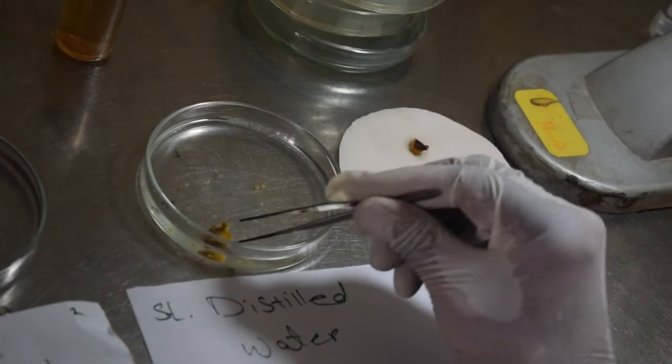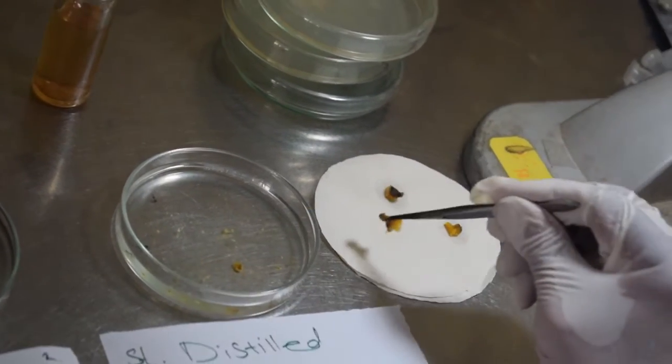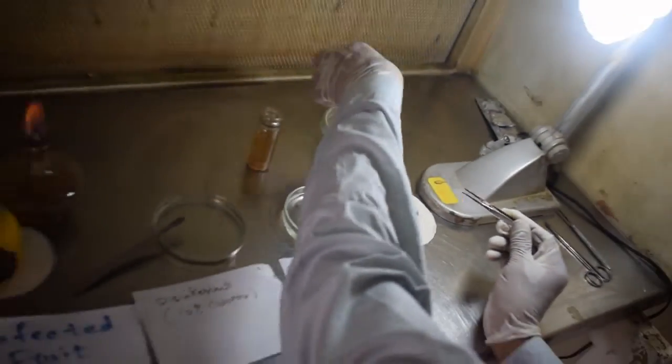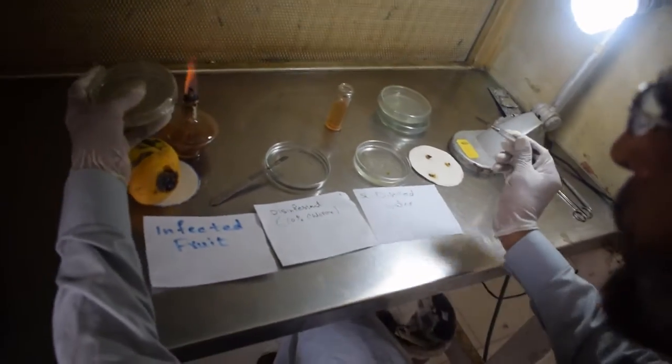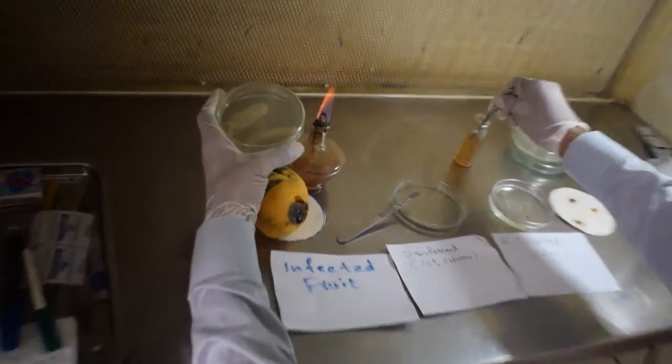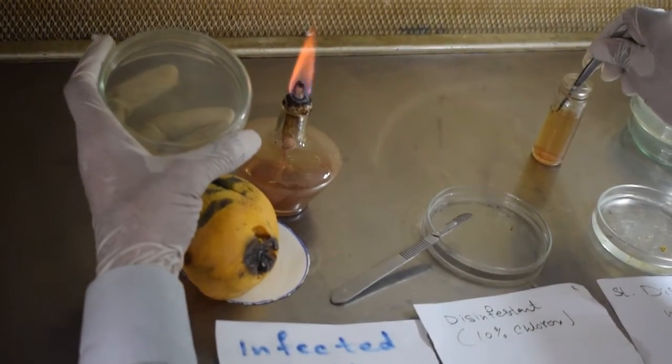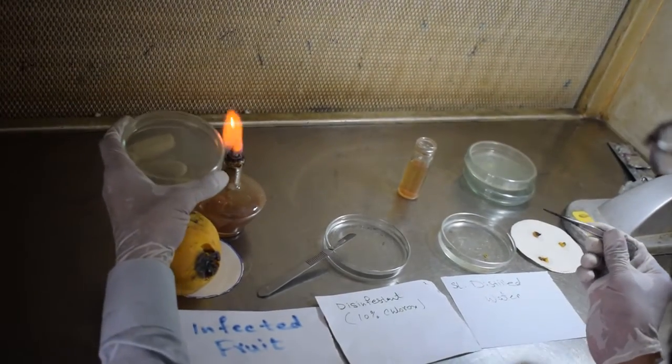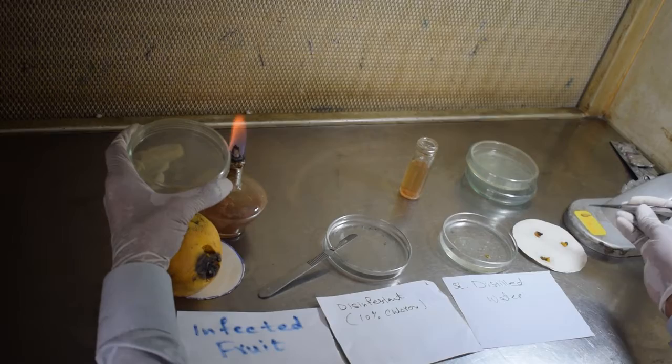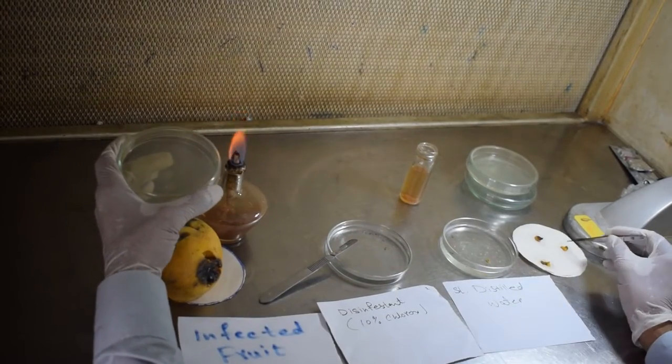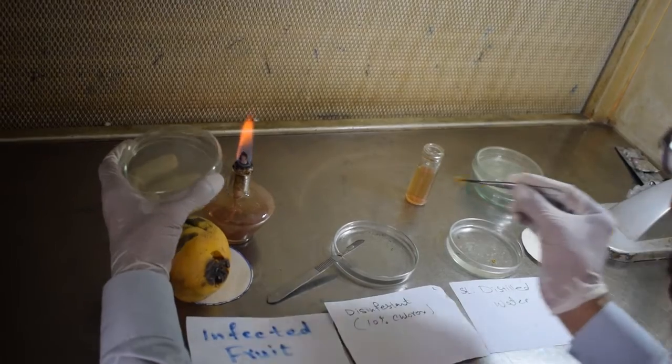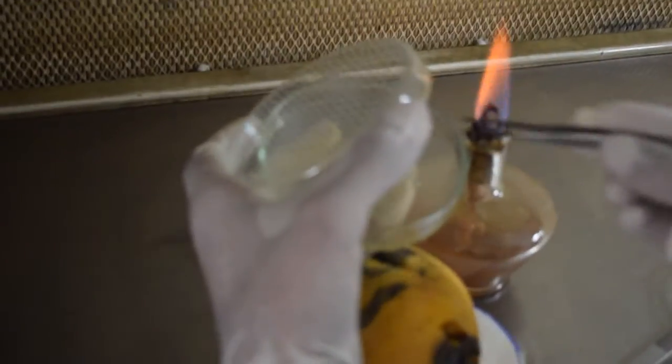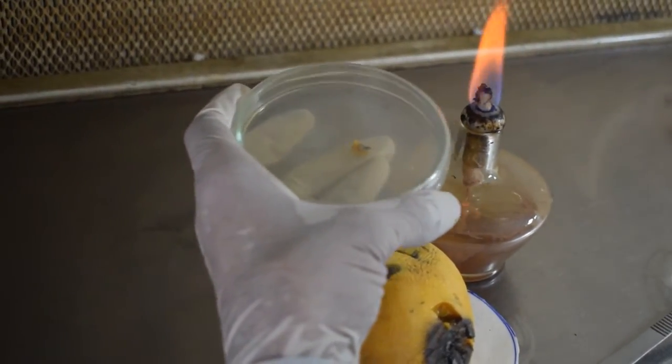For that, we should now open these petri plates very carefully with the left hand, with the thumb and finger. We should open it near the burner so that any contaminant may not enter in the petri plate. I am placing it in the middle of the plate, and it is put here.